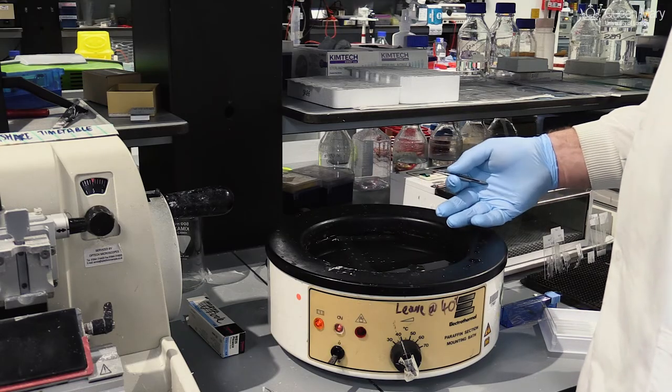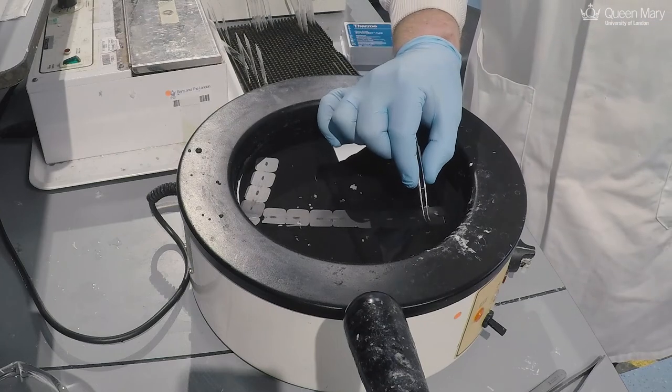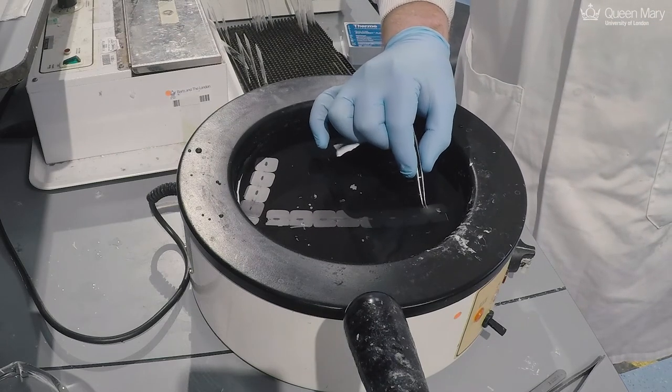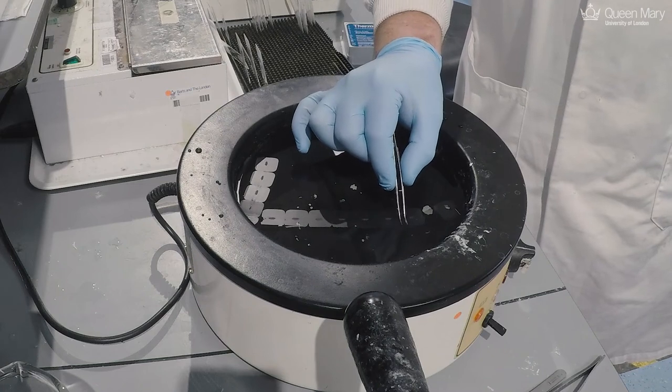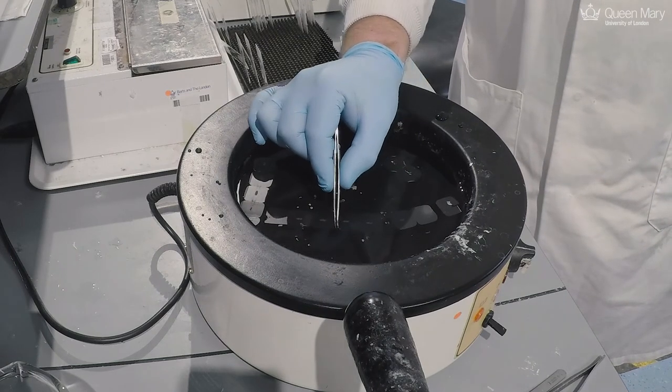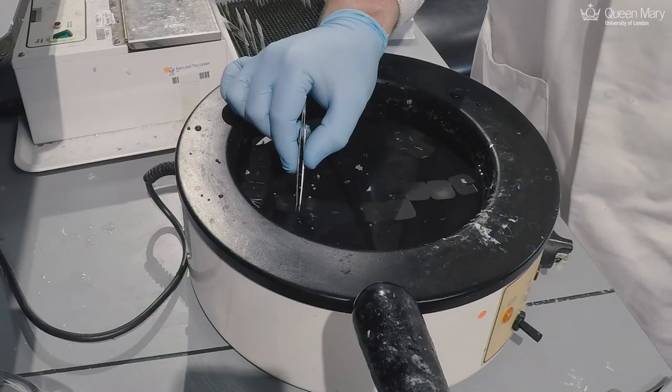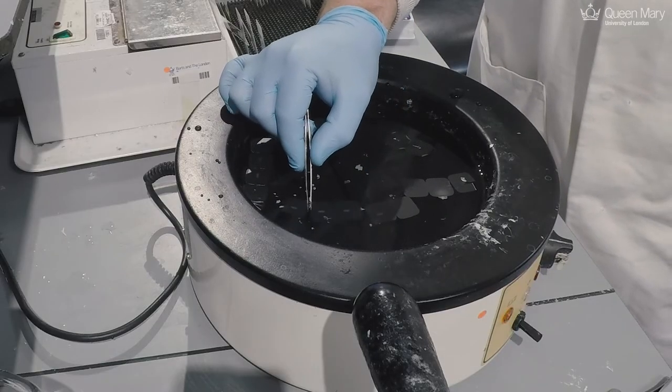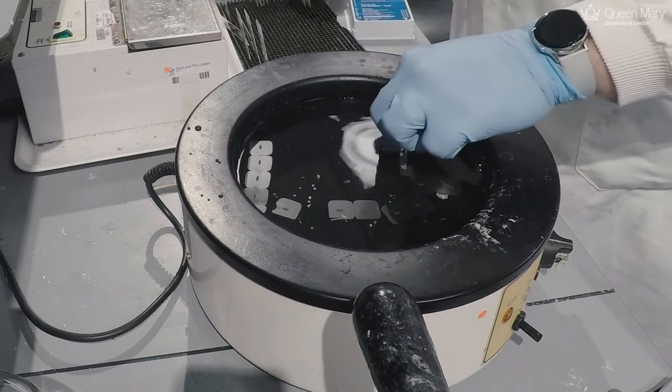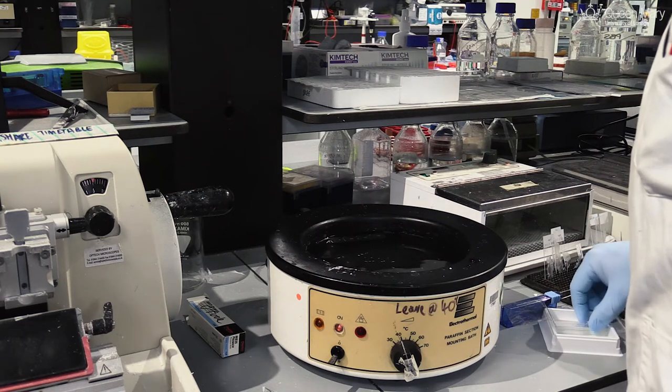So we want to separate the sections and just keep the nice ones. Any ones that don't look particularly nice—they've got holes in them or missing bits of tissue—we can remove.